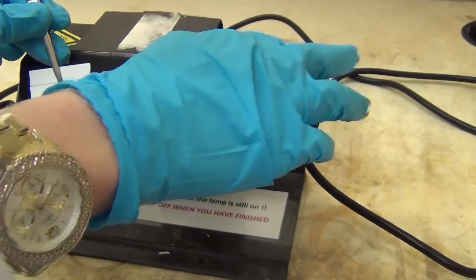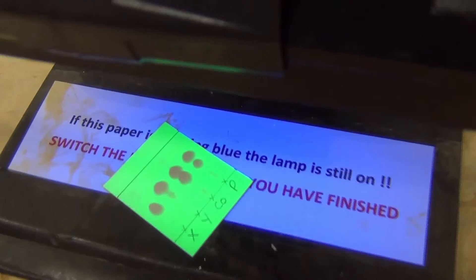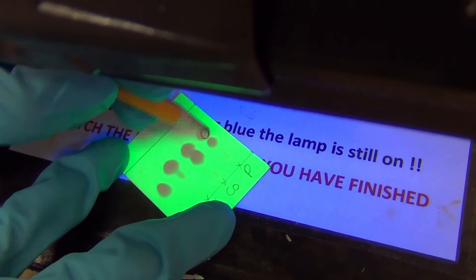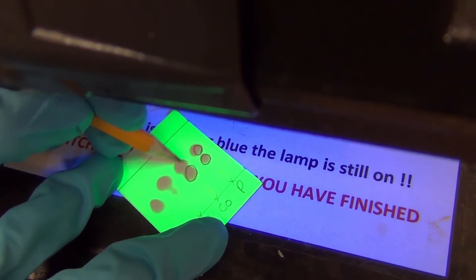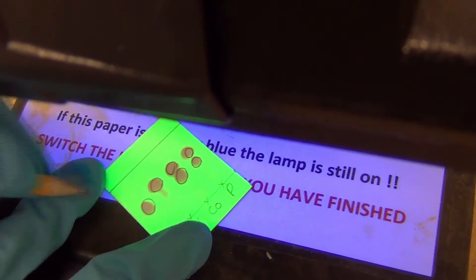More often than not, the spots on the plate are colourless, so we need to use several techniques that visualise the spots on the TLC plate. The most common technique is to first look at the plate under a UV lamp. We then draw around the spots that are visualised using pencil, being as accurate as possible.